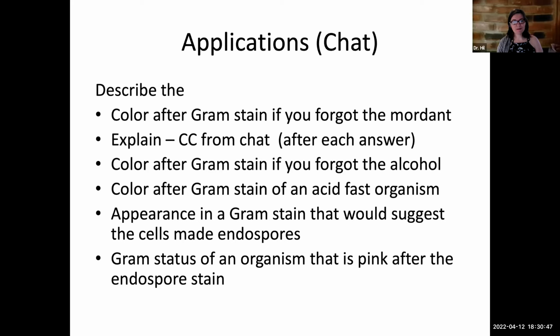Surmeet, question or comment? I have a question. Are you asking whether after the counterstain, when you do the endospore stain, you would get to know if it's endospores or not? No, the question is, I did an endospore stain. At the end of the endospore stain, the cells were pink. What's the gram status of the organism? That was my question. And most of you said negative, and I said that's incorrect, though understandable. It's incorrect because I didn't ask you what color they are at the end of the gram stain. I asked you if the cells were pink after an endospore stain, what's their gram status?